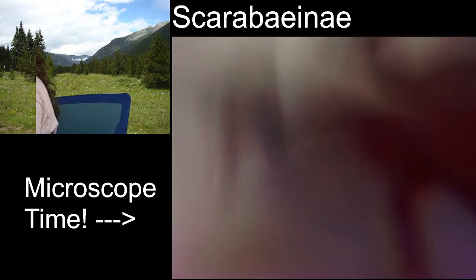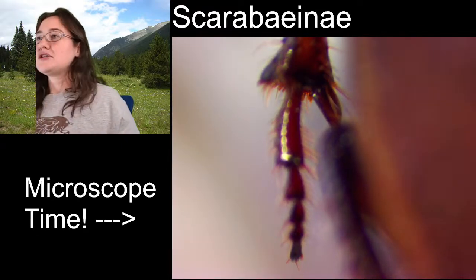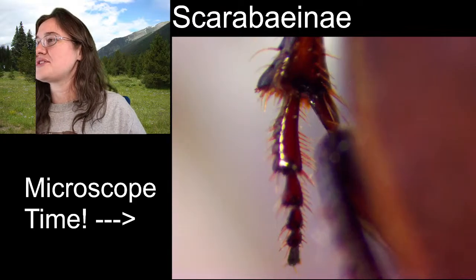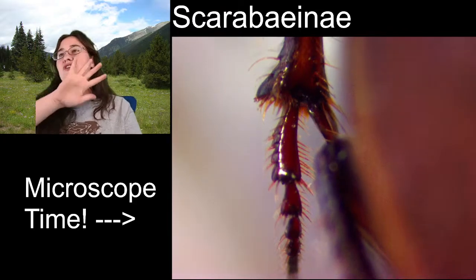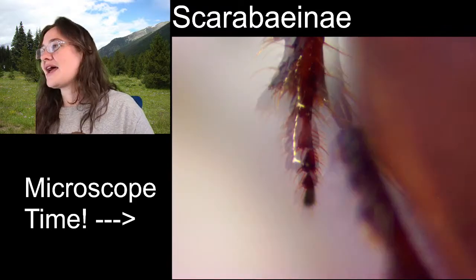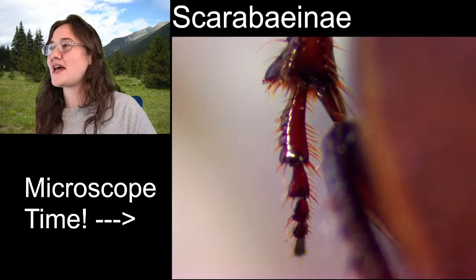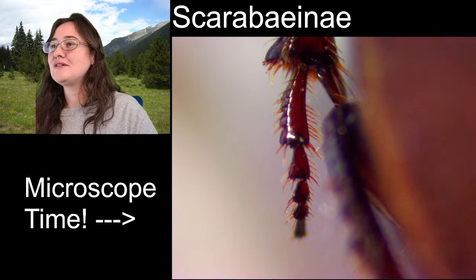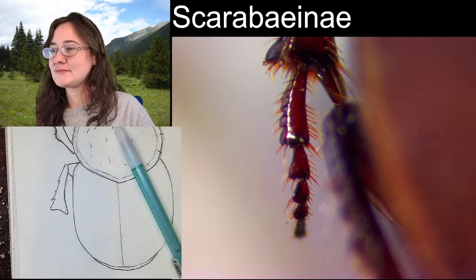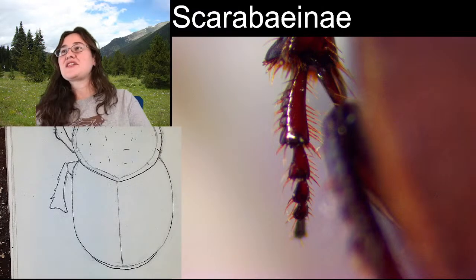So when I was looking at the middle leg's tarsal formula, I was noticing that there are 5 tarsal segments here rather than 4. And I did know that they had the same number of tarsal segments. I just miscounted. I just went to double check.